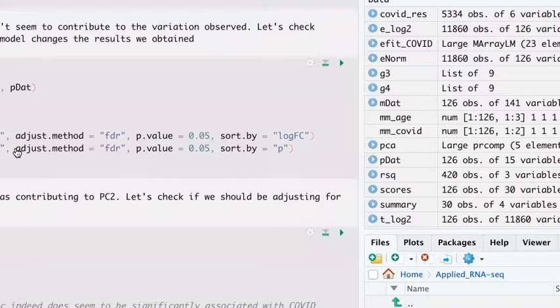In the worksheet, I do a logistic regression, but I'm going to skip that because I'll be coming to that later on in this COVID age lactate as well. And then we just follow the same functions as before.